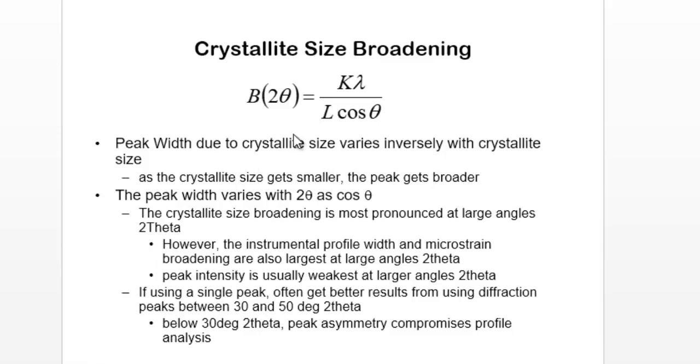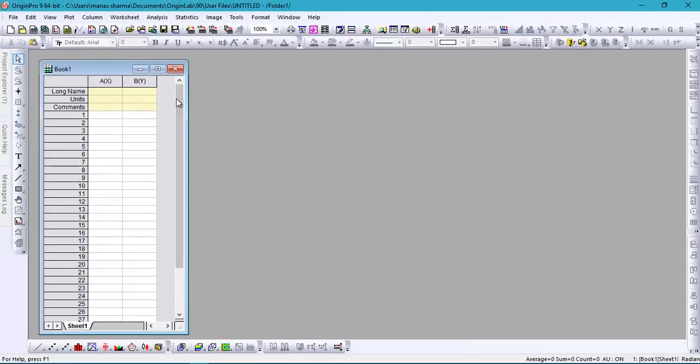Another way to calculate the crystallite size could be to use the integral breadth instead of FWHM, and that can also be done pretty easily, but I will show that in some other video. This video will be dedicated to only learning how to calculate the FWHM. To do that, we would use some kind of software that performs a Gaussian fit for my XRD pattern, and in my case I'll be using Origin. If you don't have Origin, then you should get it, or maybe watch some other tutorial, because this one is based on Origin.